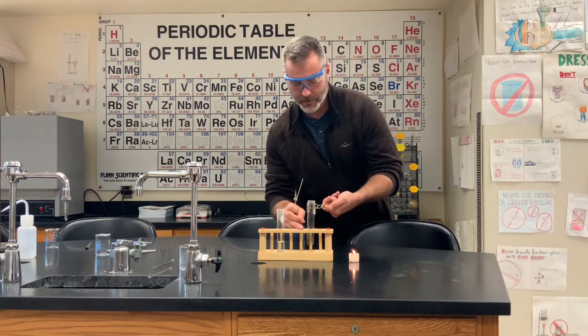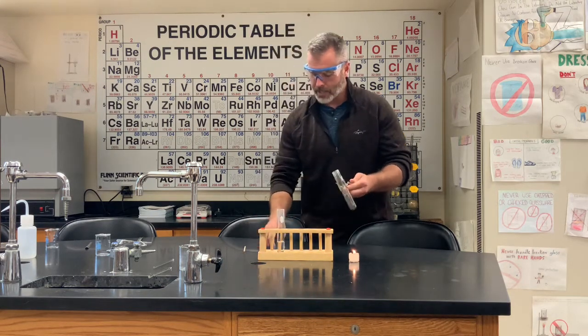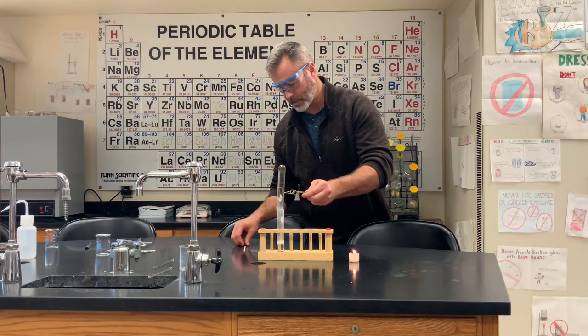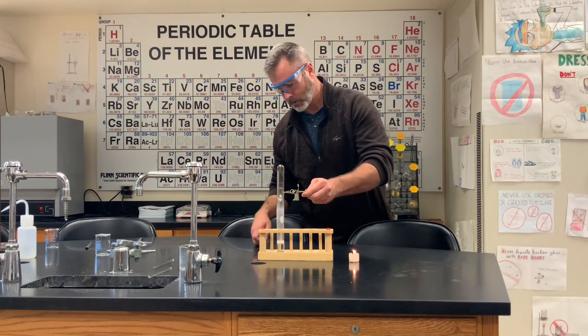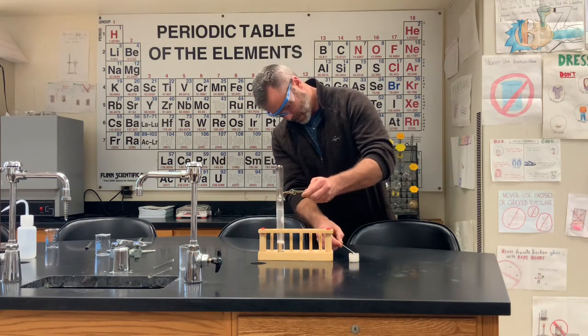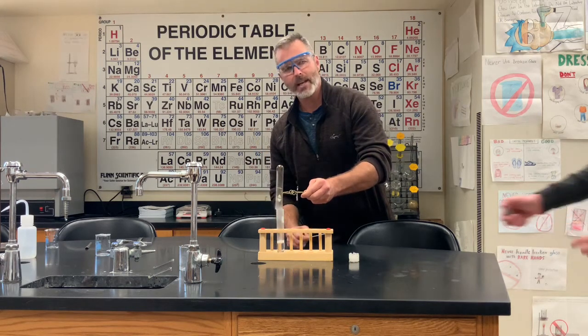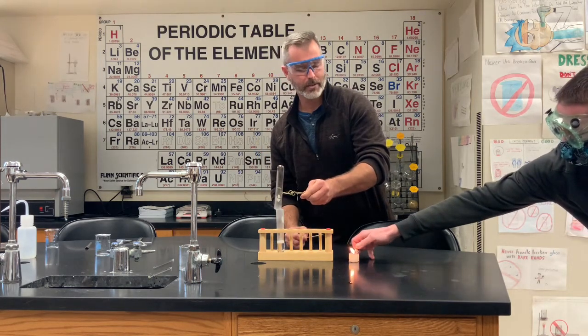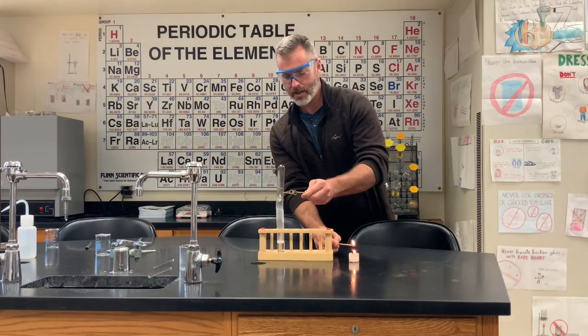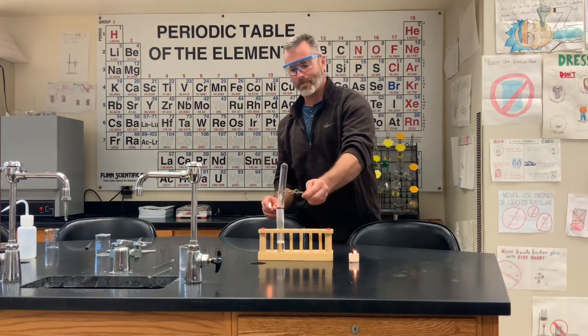So to trap the gas, I'm going to use this guy. I'm just going to hold him directly upside down over this other test tube. And it should collect some gas in there. You can see it's kind of going up. I'm going to light my splint. Through the magic of chemistry, it'll relight itself. Pay no attention to the hand that's coming in. All right, we should have our splint filled.